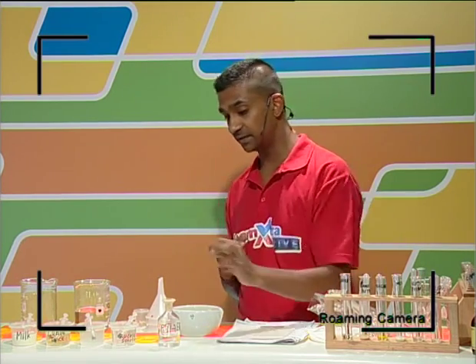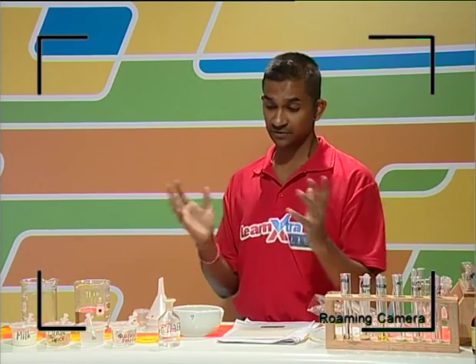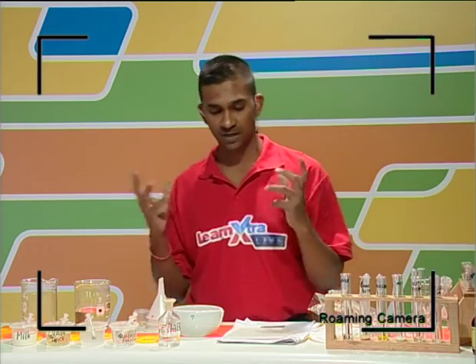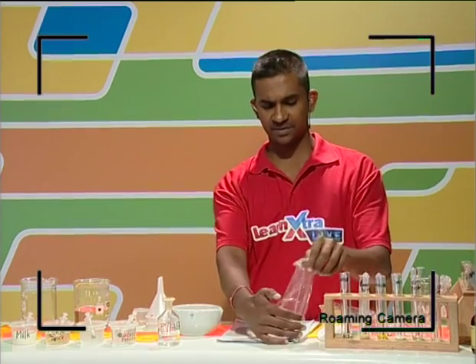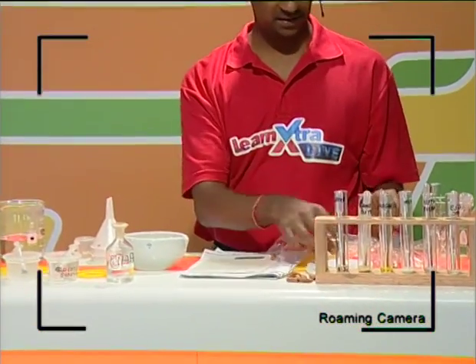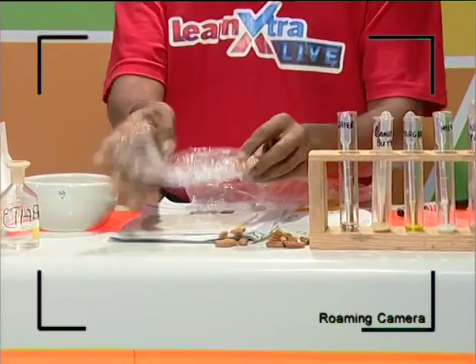So whenever you see ether or any alcohol, guys, you've got to be careful that there are no flames around where you work, and that the windows around you are open and there's lots of ventilation. Okay, so I've got different food samples here, guys. I've got some pecan nuts, some almonds, and some normal peanuts.